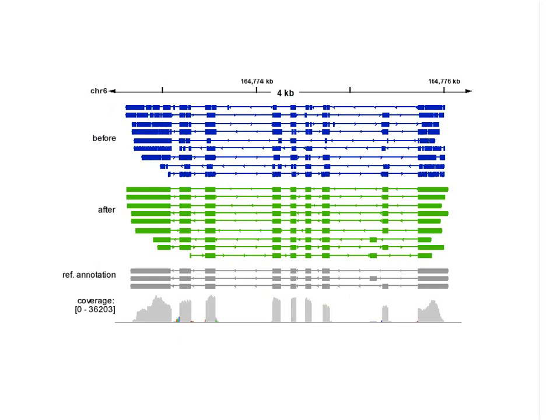sequenced with PacBio and Illumina. And in green, after correction, you can see all the exons are represented, and at the very bottom, there's two splicing variants where that next to last exon on the right-hand side is in a variant splice form. And the reference annotation is in gray on the bottom there, and you can see we picked up 2 out of the 3 splice variants in the post-corrected data. So we are starting to do more experiments with RNA-Seq, but these are preliminary results. Fusion genes, fusion transcripts, cancer cell lines are all things that we're confident our program would work well on, but we haven't done any work with the actual data yet.